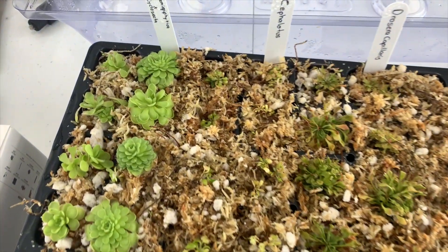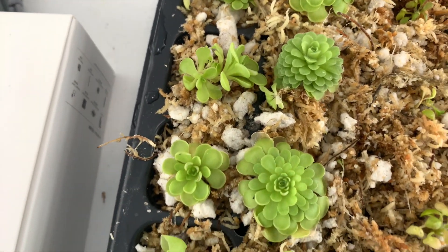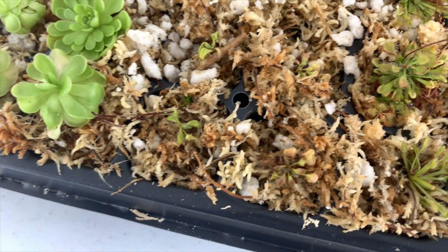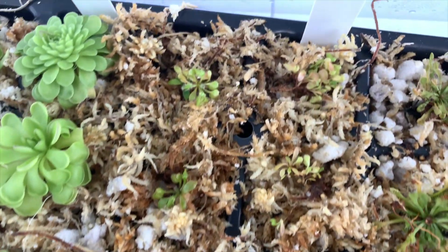It has been a bit since some of these plants came out of tissue culture. The Pinguicula is doing great, as I expected — they usually do very well whenever I transfer out of tissue culture. The Cephalotus is doing okay, a little light on color, but they usually take some time to adapt.